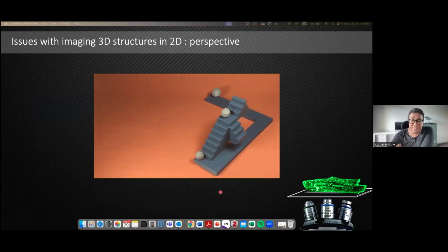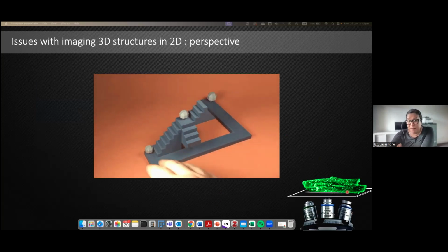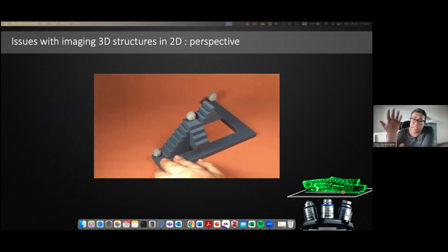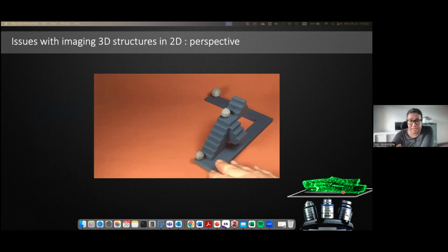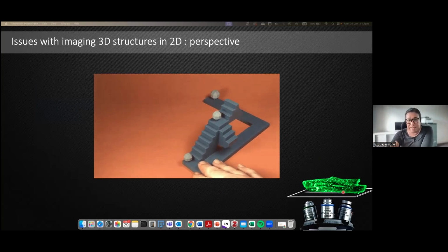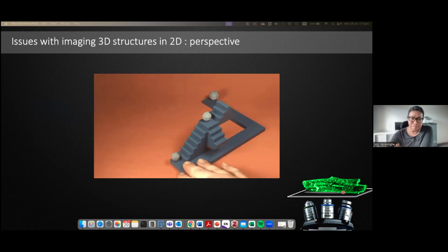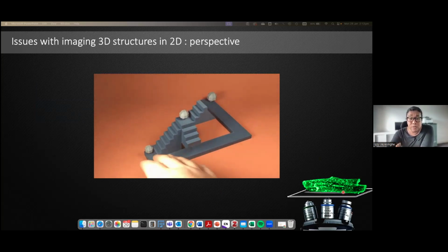And the reason for that was that a lot of these clusters that I showed in the previous slide came from just beneath the cell surface, and they were often flat arrays, or what we thought were flat arrays, of clusters. Essentially, STORM and DNA-PAINT localization microscopy is primarily a 2D imaging method. You can do 3D implementations of it, but the question was whether we were able to capture the full 3D complexity of it.